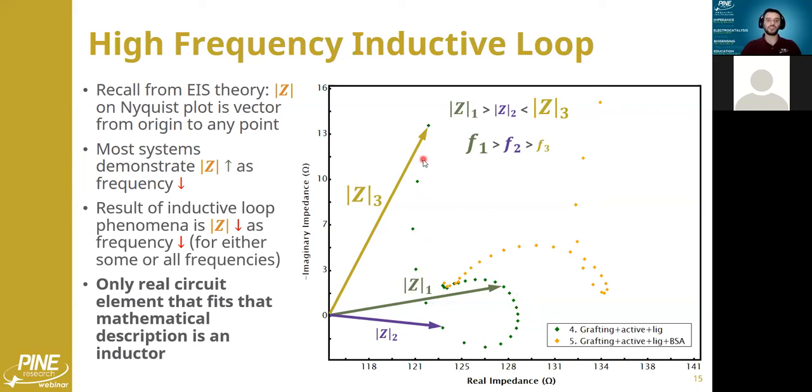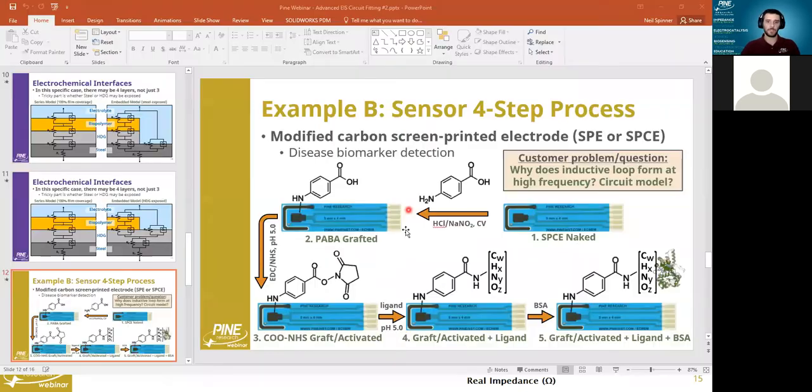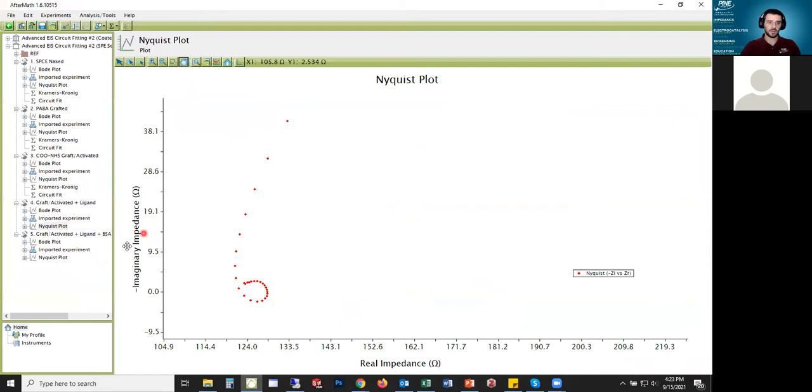I'm applying a model that doesn't necessarily have physical meaning. It's just an inductor to make this loop happen, but I'm doing it because I want to fit the rest of my data. I want to get a value for the charge transfer resistance and the capacitive element of the rest of my data. And so to do that I have to fit this part. And so to do that I need an inductor. So that's kind of a roundabout way of saying why I need to use this inductor.